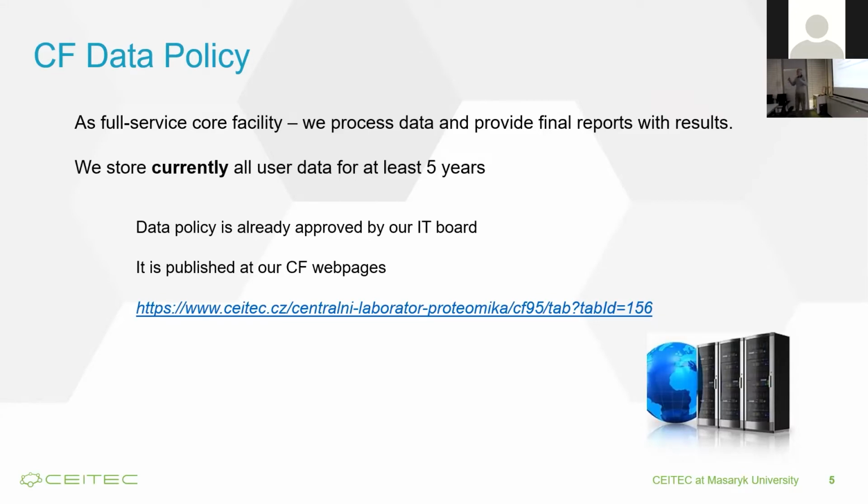And of course, we are able on demand to provide users with raw data. It's no problem. And also we can arrange a deposition of your data in publicly available repositories, which is standard when you want to publish proteomic data, you need to make them public. So we can do it also for users. The question is how long we can do it, because with these new instruments the size of data is increasing. So up to now we are safe, but in perspective of several years we will see.